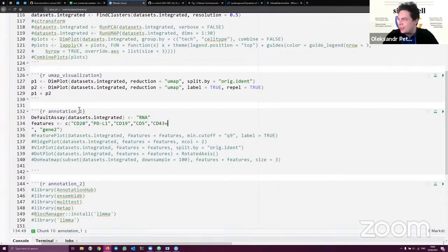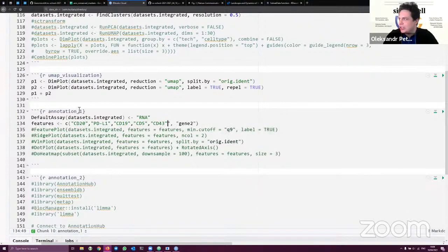Because not all of the CD genes are actually also named CD. So from Andrea, we have PDL1 plus. Yes, I know, but the gene name is definitely without the plus. So, okay, IRF4 is definitely a gene name, and remember that. IL9.